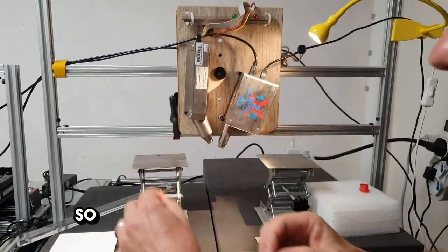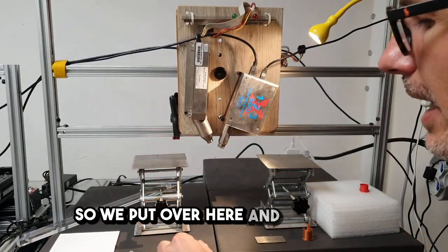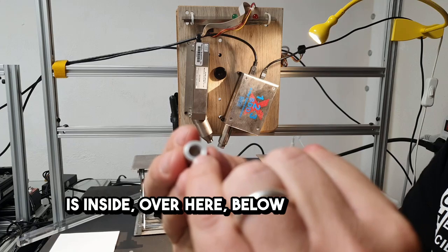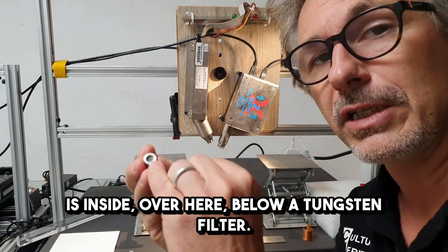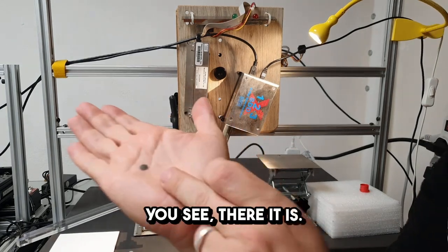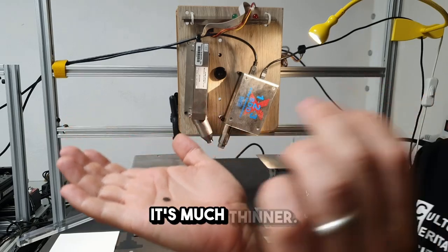This one is an aluminum filter, so we put it over here, and then there is, inside below, a tungsten filter. So we remove this one also. You see, there it is. It's much thinner.